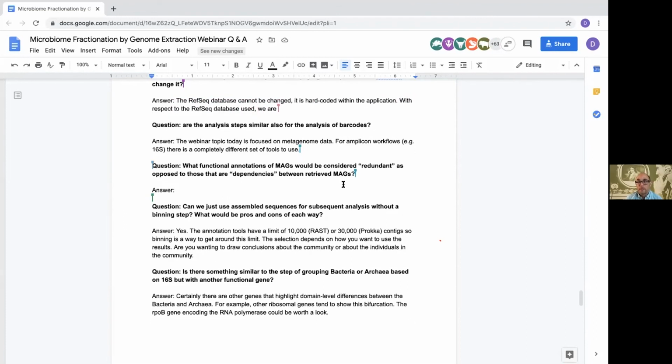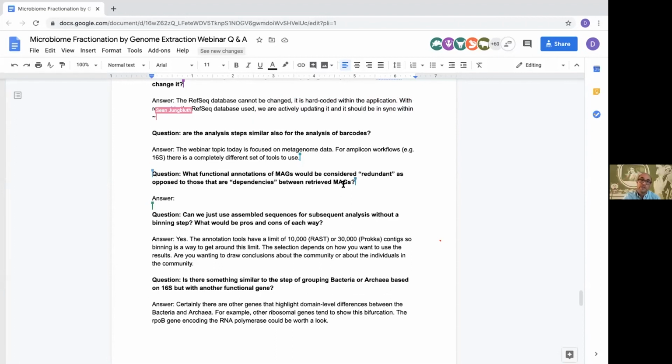And it's going to be dependent on what that analysis looks like. I would say probably if you have separate MAGs, but the same system components are significantly overlapping, and then other system components are missing, it's probably the result of that lineage not having decent coverage of the gaps in that pathway, the gene families that carry that out.